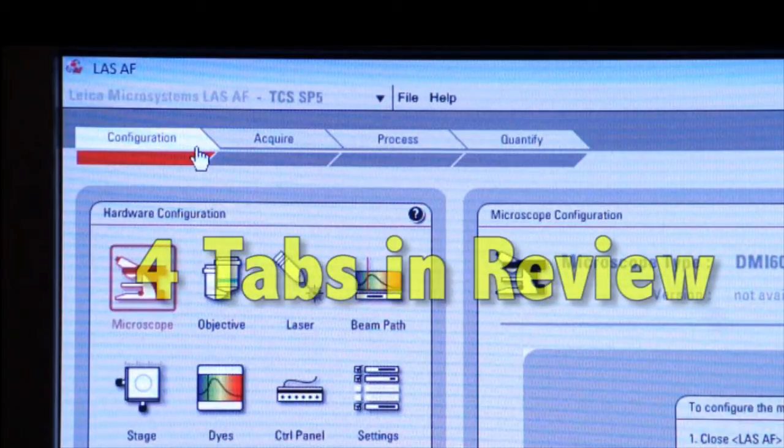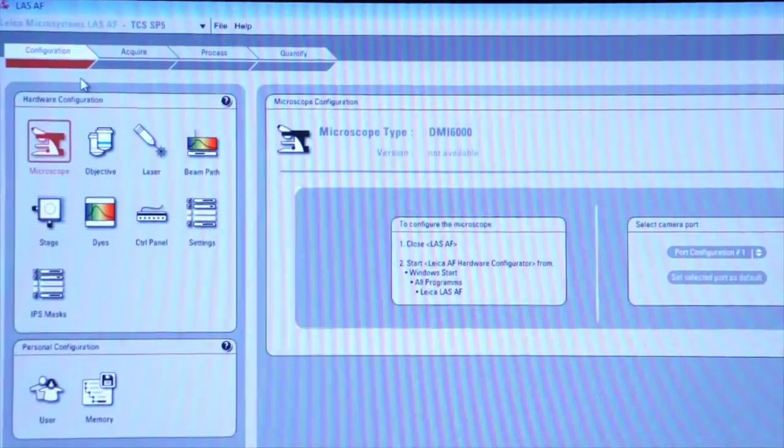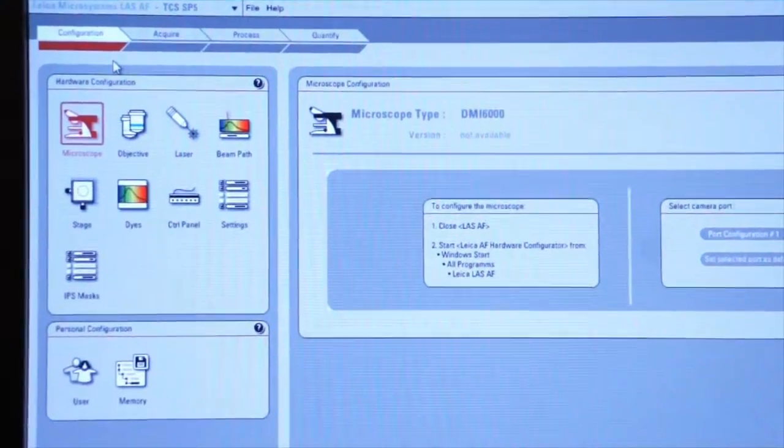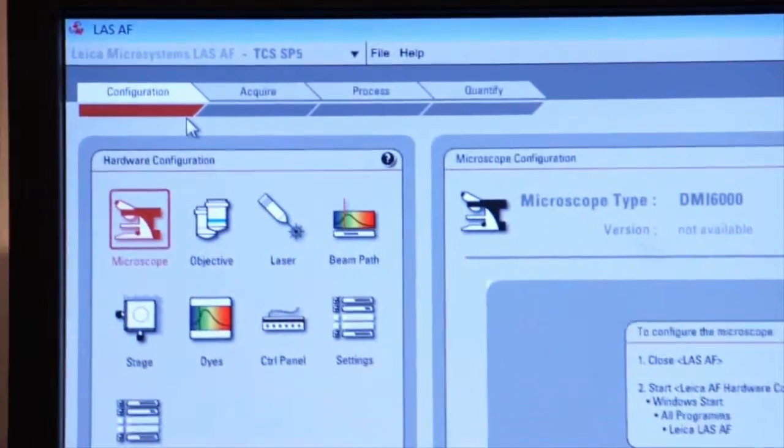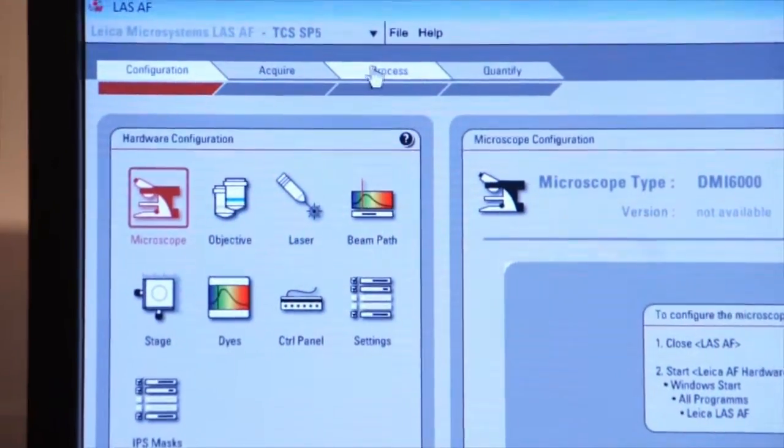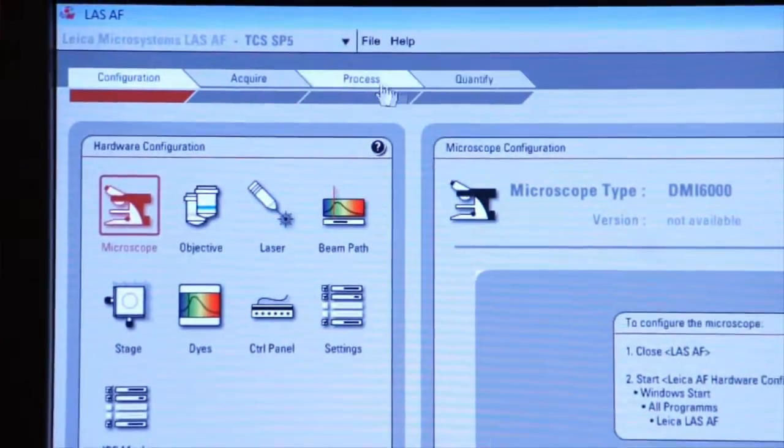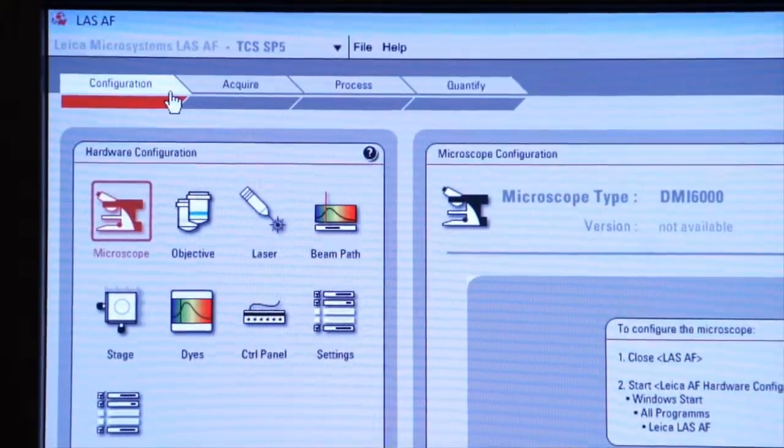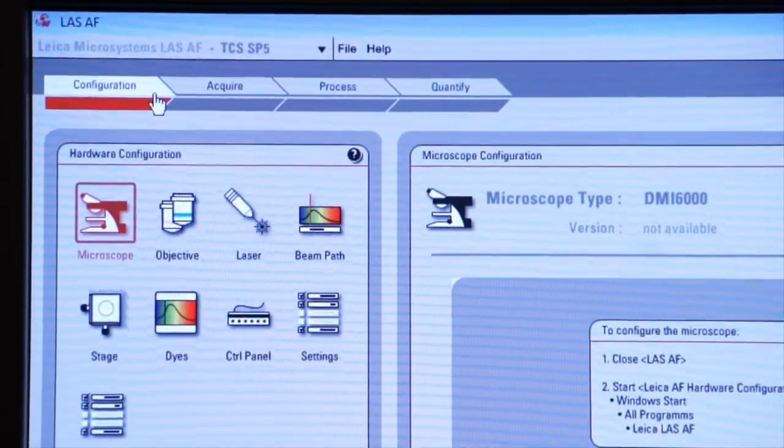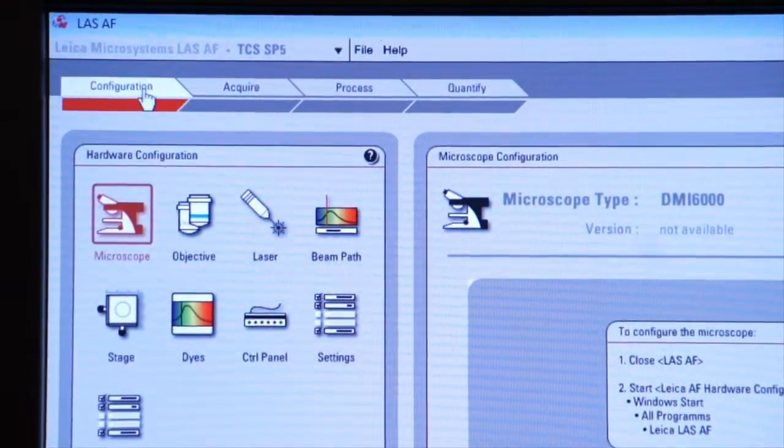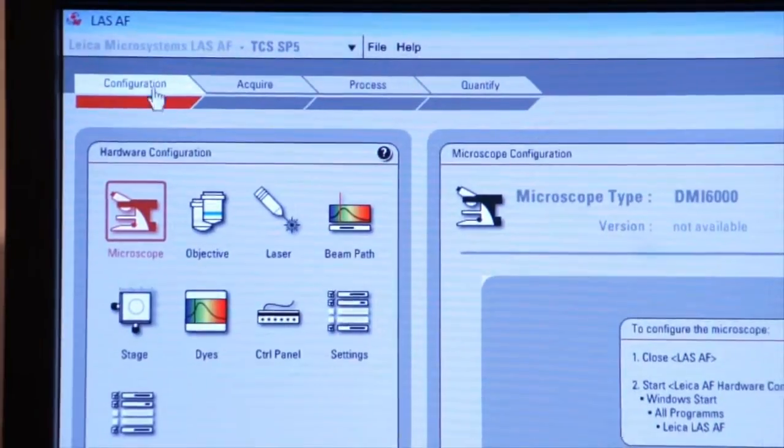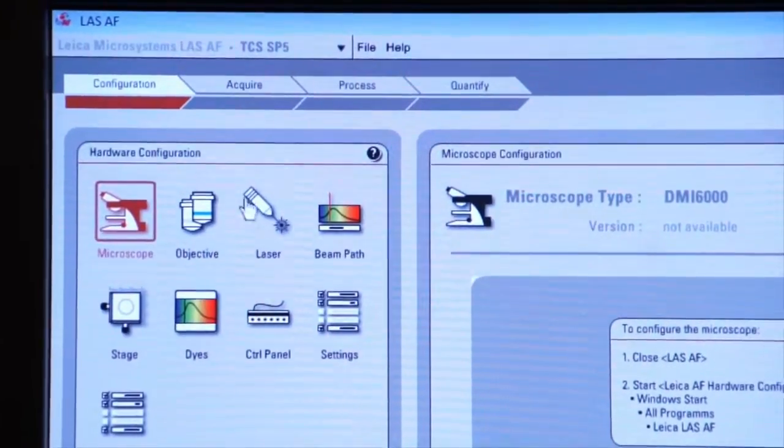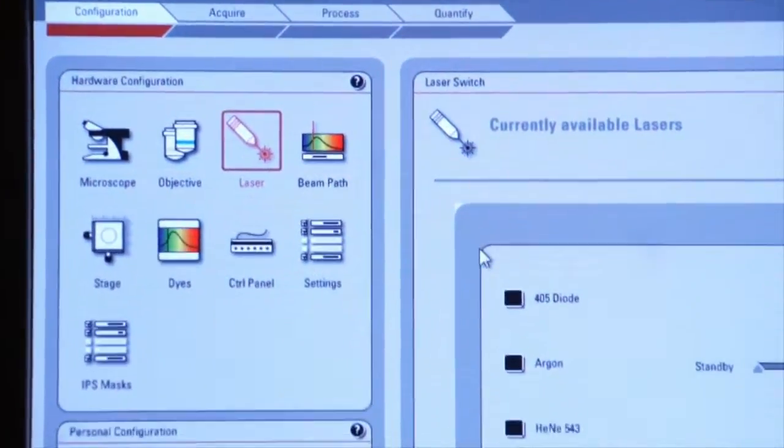Now we're going to continue with where we left off last time on the LASAF software. By way of review, I want to remind you of the four tabs that are across the top left-hand side of the LASAF software screen. The Configuration tab allows us to select the lasers and then turn on each laser.